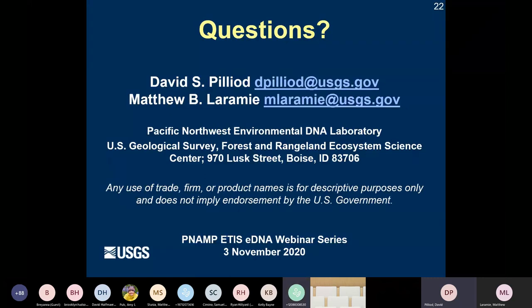Yeah, I agree 100%. David showed some of these technologies being developed for sampling and then doing all your analysis in the field on site, which is a totally different approach than what I described with the lab extraction. So that's really a completely different protocol altogether. And then there's the robotic stuff. So there's a lot of different applications on the horizon that are being developed. And I do understand the need for having some standardization, or at least several standard options, so that folks don't have to know every single thing about everything that we just showed.